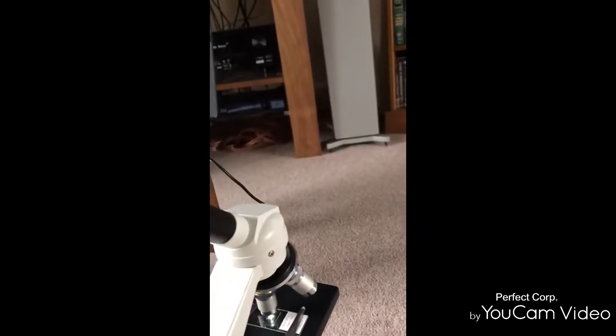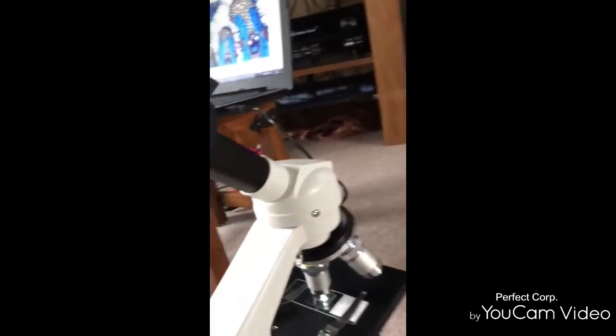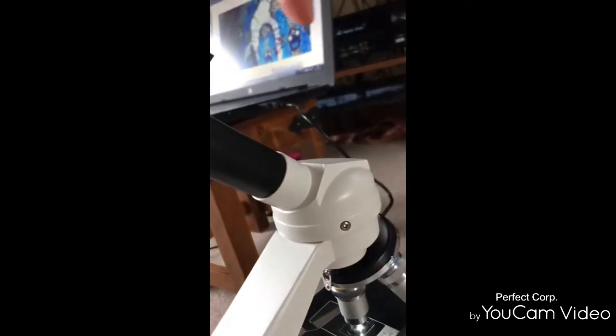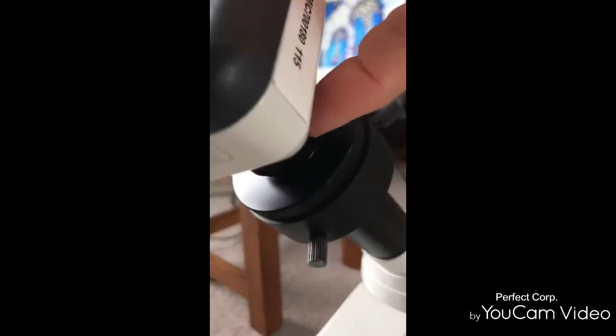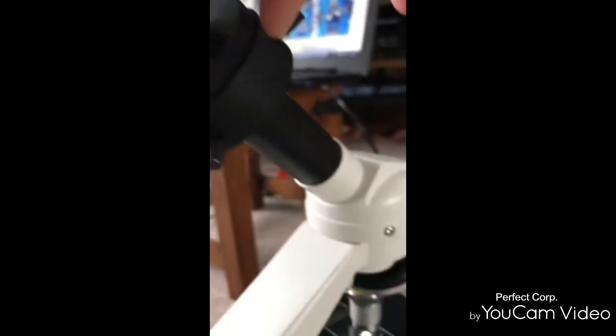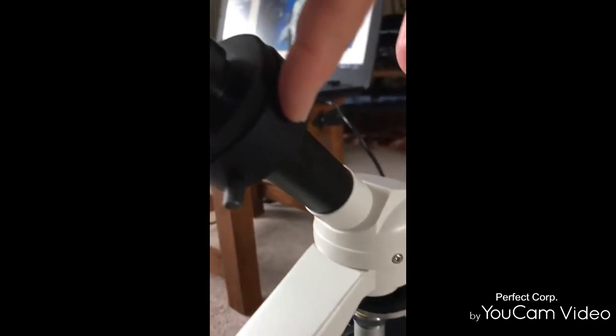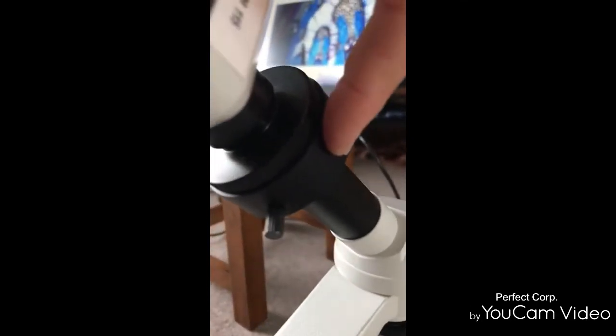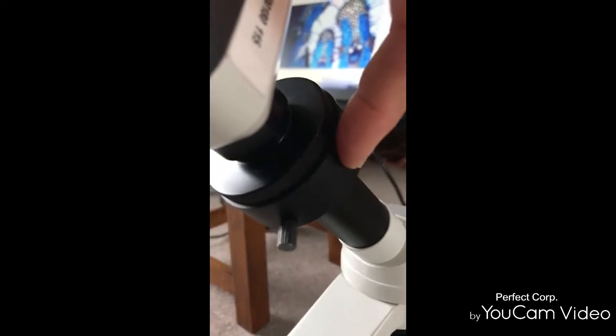This is the Motorcam, this is the focusing lens, and this is the eyepiece adapter.